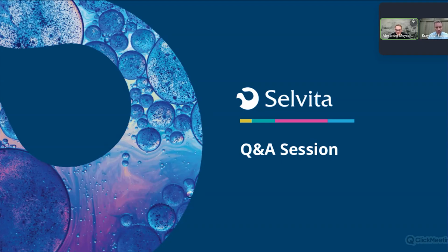Thank you. There is another question, also from Gabriela, about the delivery of data. How is the data delivered? Do you provide only raw files, or also analyzed results? Okay, thank you for this question. We can also provide raw data if it is required by the client, because sometimes clients would like to perform their own processing of mass spectrometry data.